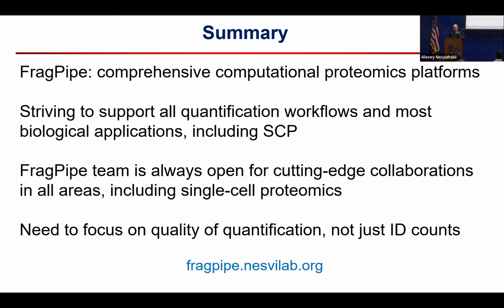For DIA-Umpire-style data, we start with detection of an MS1 feature to assemble a precursor-fragment group. So there we depend on detecting MS1 in that strategy. It doesn't have to be super rigorous MS1 detection, not like you have to see 5 isotopes with the right shape. We can relax the criteria, but we've got to see at least some MS1 signal.